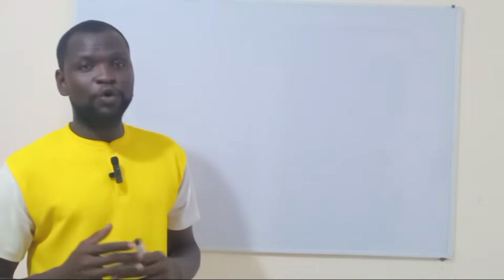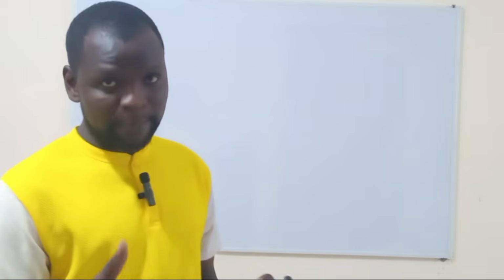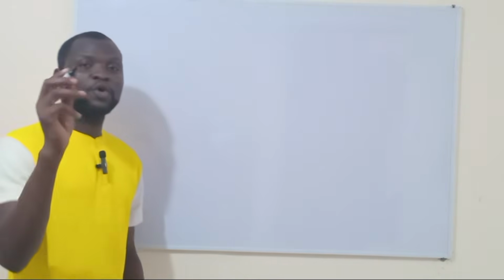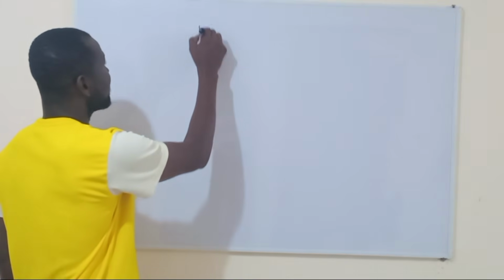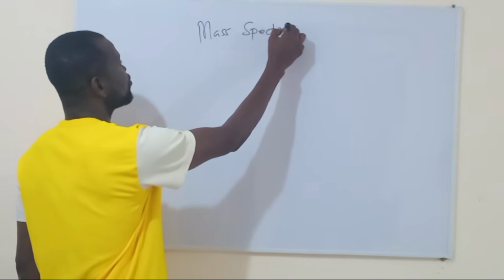Do you have difficulties when it comes to the study of the mass spectrometer operations and its calculations? If yes, today I'm going to take you through the operation of the mass spectrometer and the various calculations it comes with. So let's move on to look at that topic. Today we'll be looking at the mass spectrometer.